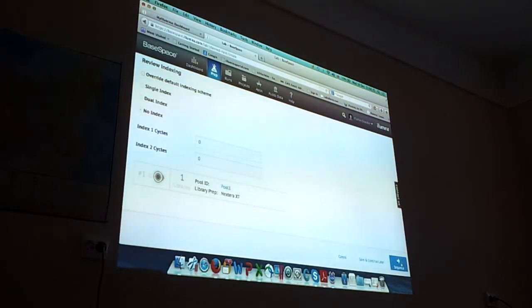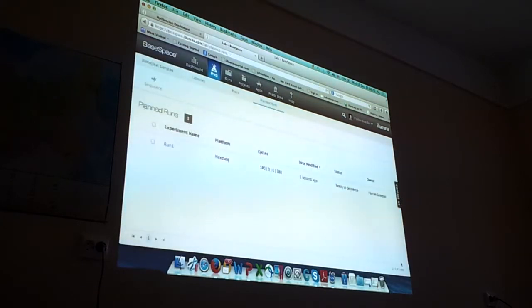And then you go to sequence. And so now I have created the run, and then on the next tick I can select it and start it.